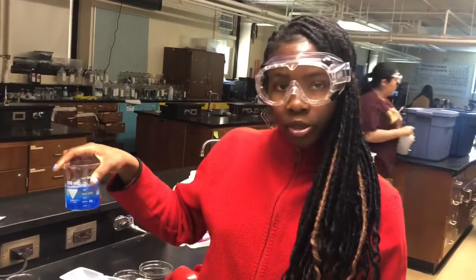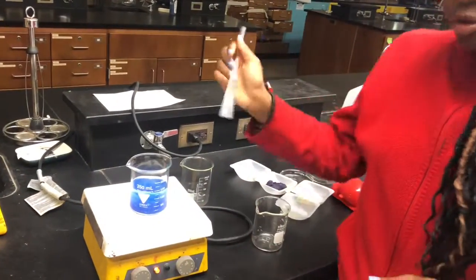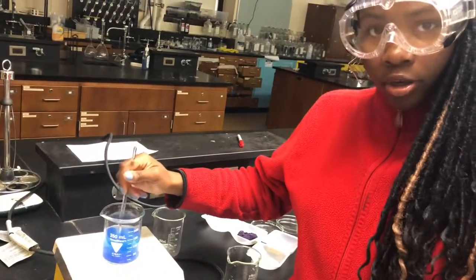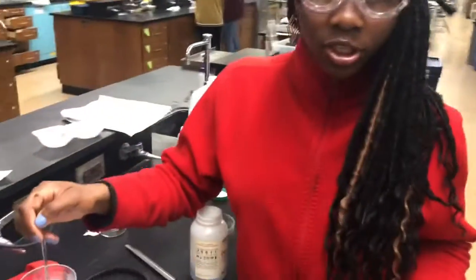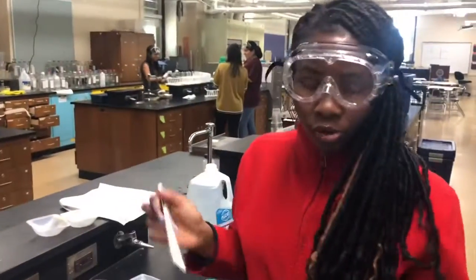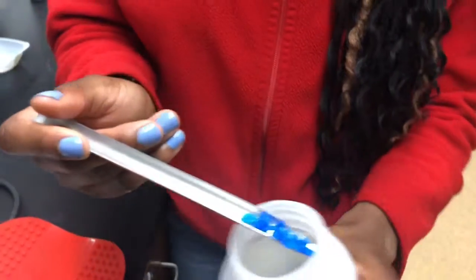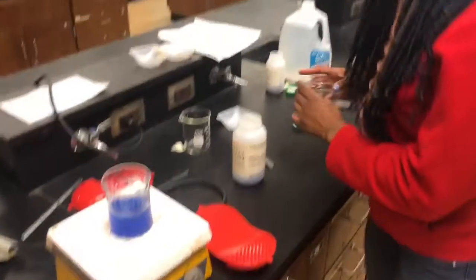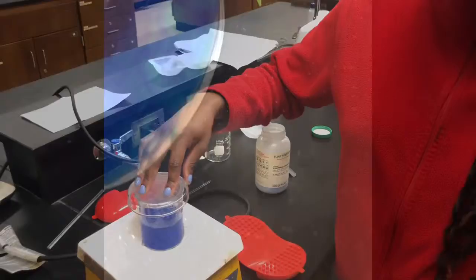Then you put the copper and water in the beaker and you start to dissolve it. If you need to, you can use a stir rod to help it. So once this is fully dissolved, you grab a couple pieces of copper sulfate from the stock and you add it to the solution, and then you use a watch glass and cover it.